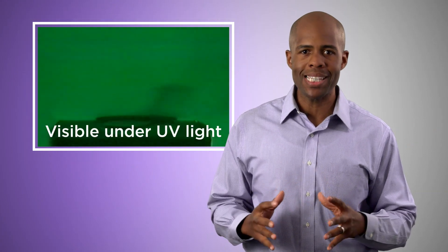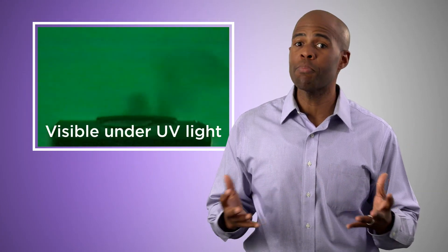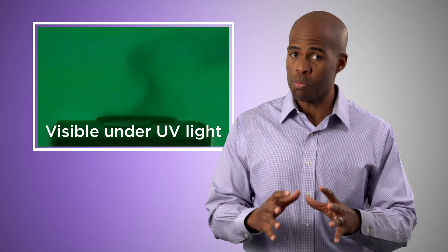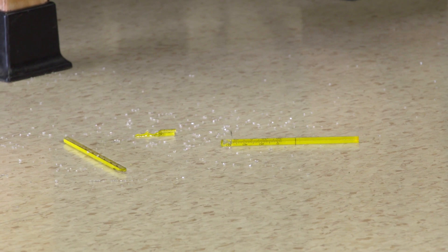Mercury also is dangerous because it can vaporize. Once in the air, mercury vapor cannot be seen and has no odor, which means you can be breathing mercury vapors without even being aware of it. What's more, mercury doesn't go away. Once spilled, even tiny amounts can stay in the room for days or weeks, filling the air with its vapors.